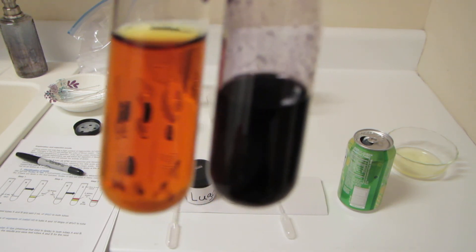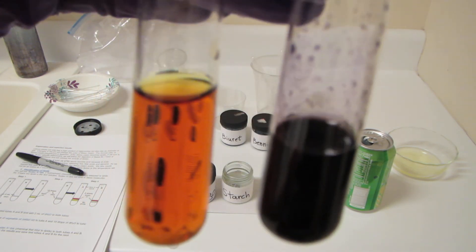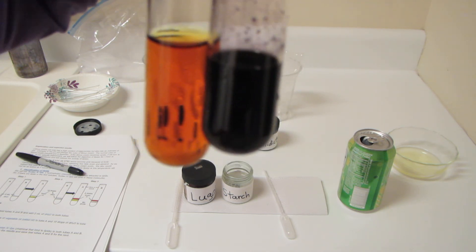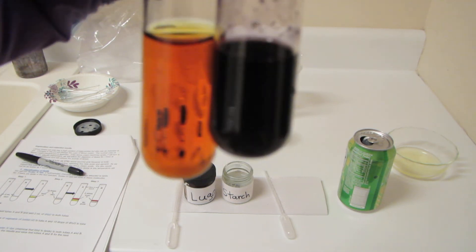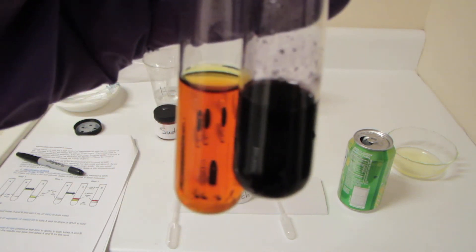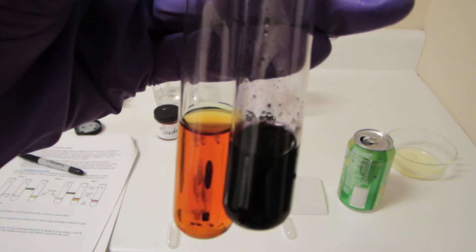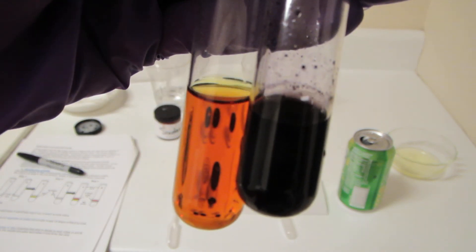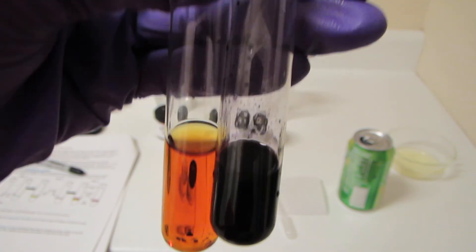This shows that when you mix Lugols solution with starch, you get this dark, almost black color. Lugols solution is very effective for looking for starch. If you need to figure out whether a food or solution contains starch, just mix a little Lugols with it, look for this dark reaction, and voila, you have your answer.